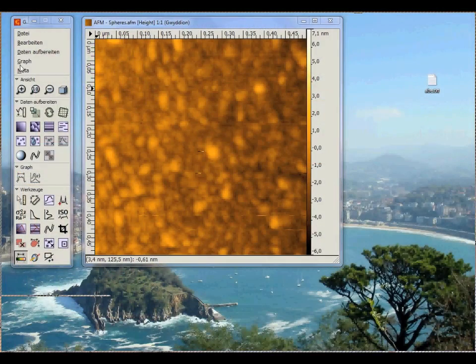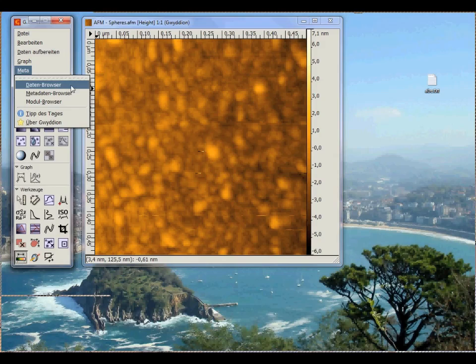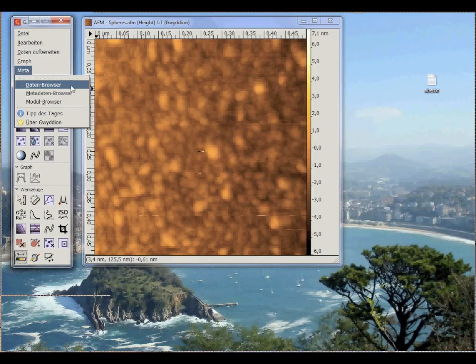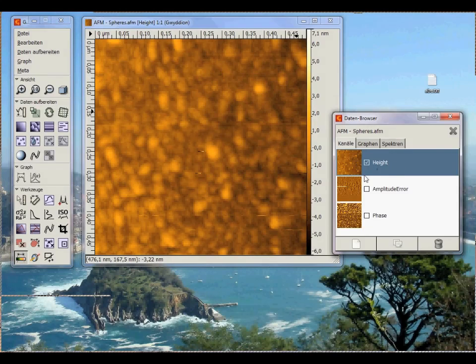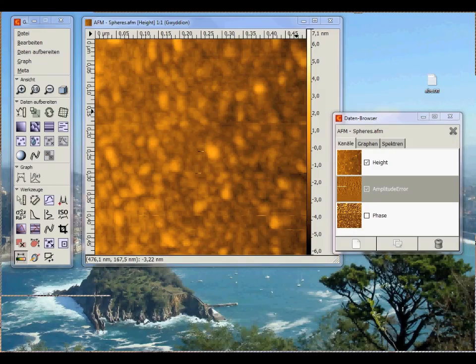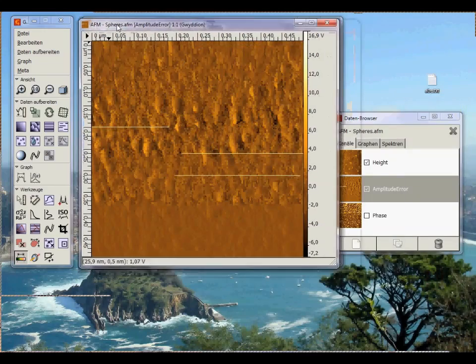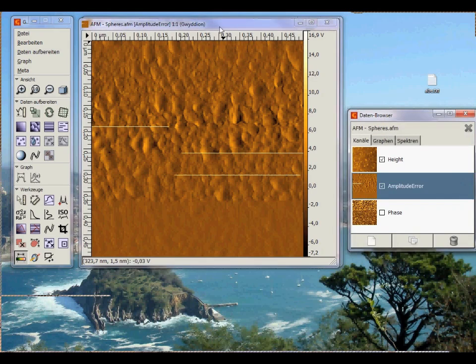Now I'll show you how to display the metadata for the different channels of an image. In an AFM image, usually the topography or height channel, amplitude or deflection channel, and the phase channel are saved into the image data. In order to display them, go to Meter, Data Browser, and select your desired channel. Here is the amplitude channel for example.